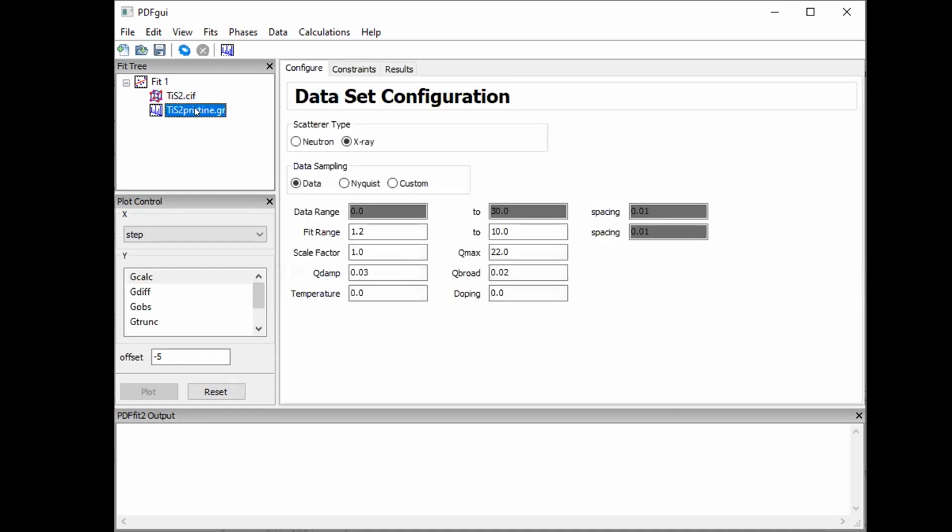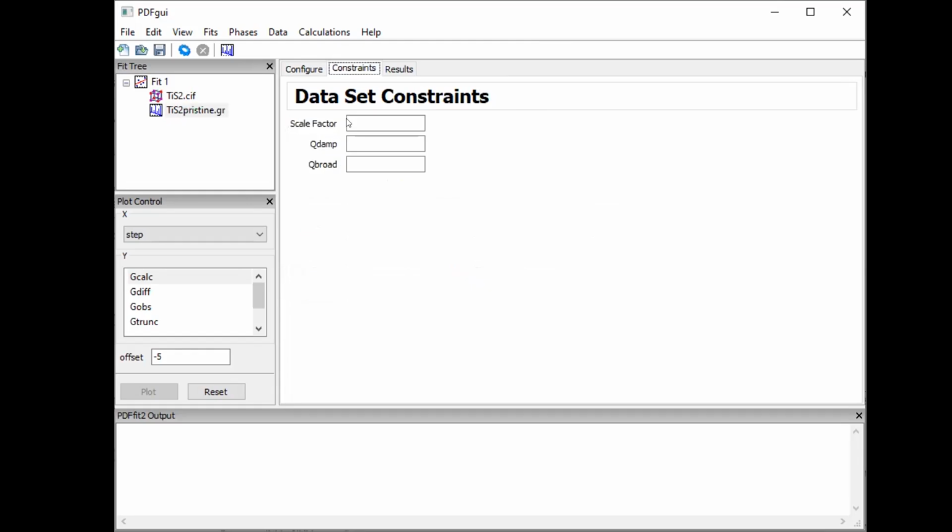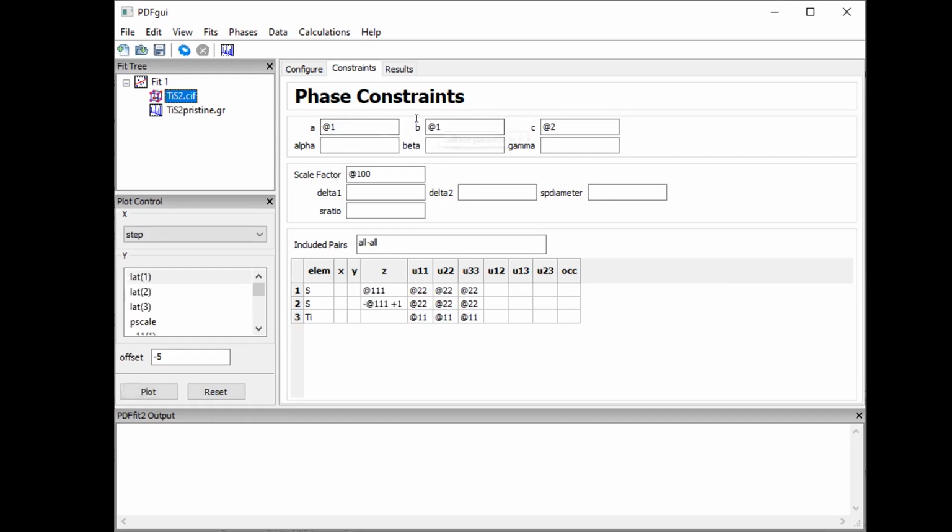Let's move to this histogram. We have this that needs to be defined. Let's go back to this one. We have this delta 2 not defined, so let's put it to 200, just to remind ourselves that this needs to be refined at a later stage. So you see, generally the value of the number follows the sequence of the fitting, right?